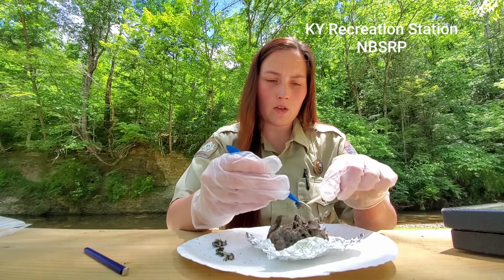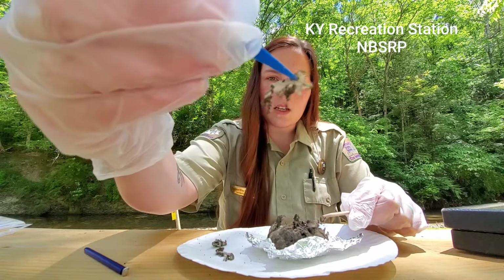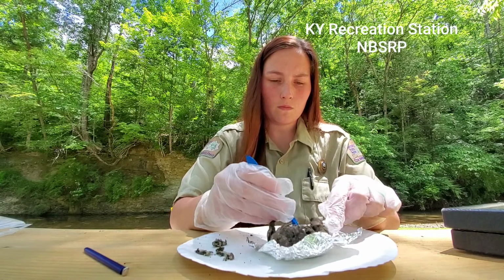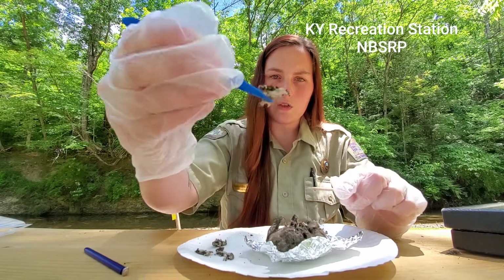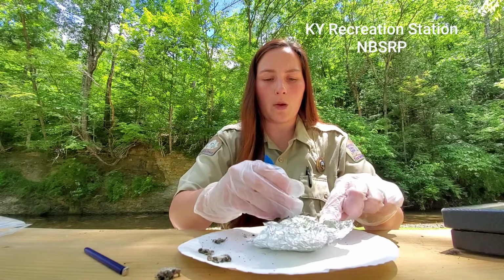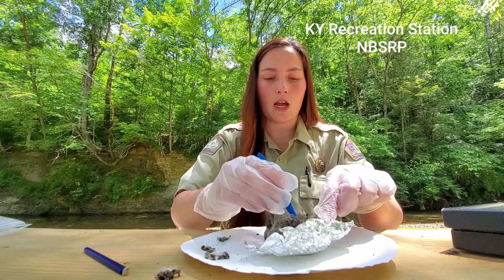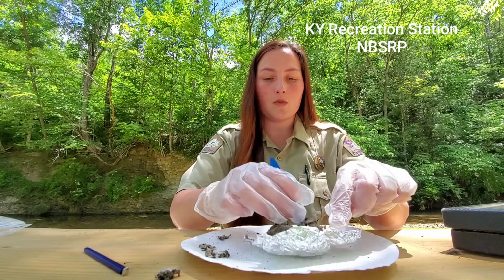Alright, so this might really help us determine what we have. If you guys can see here, this is a skull bone, so I've got sort of a little tooth going on there. And I actually have the other side. So that should definitely help us when we're determining what kind of prey we have here. Now, an owl pellet doesn't always contain just one type of prey. It can contain numerous. So sometimes you might have more than one prey in your pellet. Sometimes you might have just one.